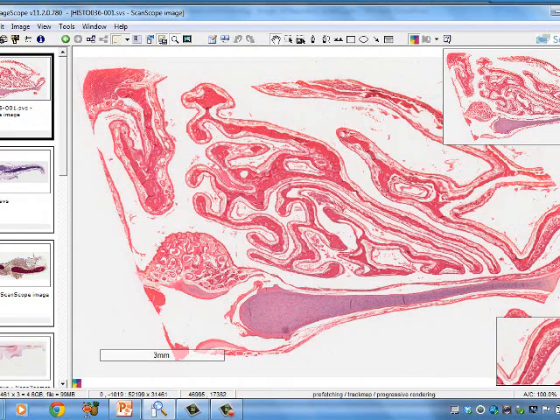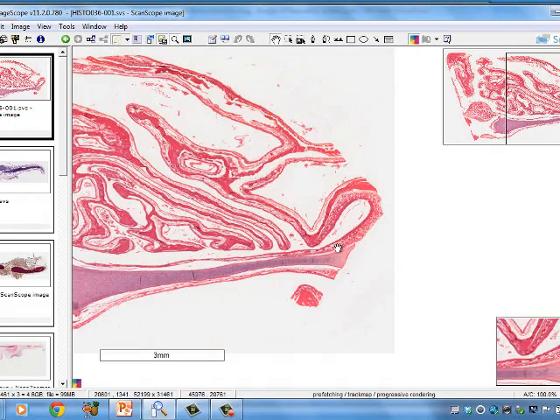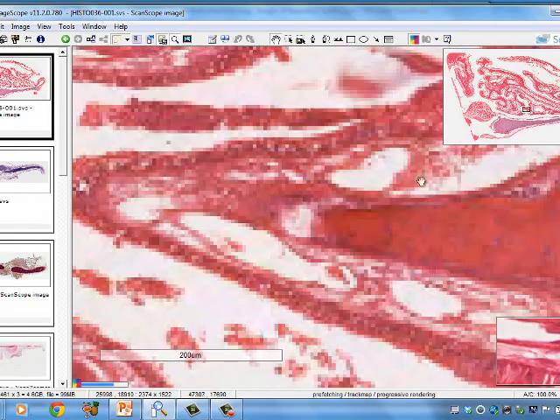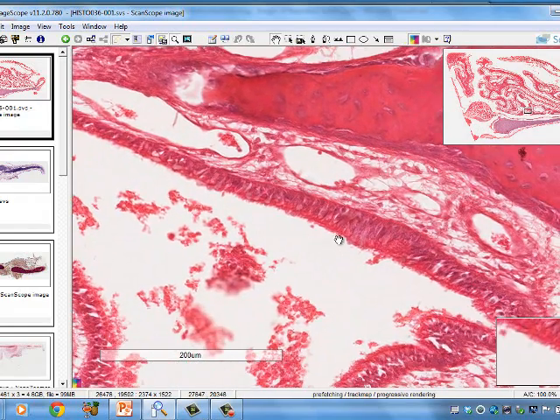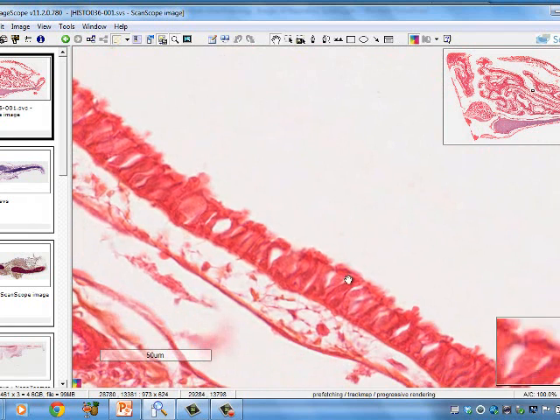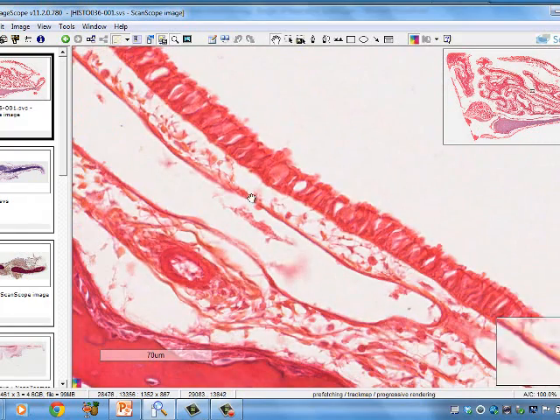And so if we look at this area right over here, we'll be able to see the olfactory epithelium. So this is the olfactory epithelium, Bowman's glands, high vasculature that we see in the area. If we look over here, we can see respiratory epithelium, pseudostratified columnar epithelial cells with goblet cells and cilia as well. Here again, you can see the cilia on the surface, the kind of dark line through there are the basal bodies, and you can see the rich vascular supply.